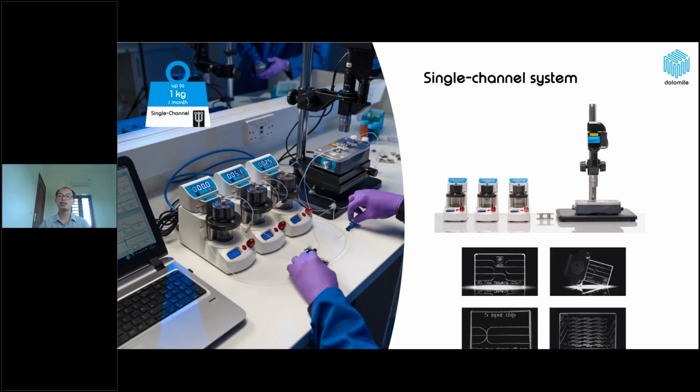Here is our single channel system, which is commonly used at R&D and lab scale.